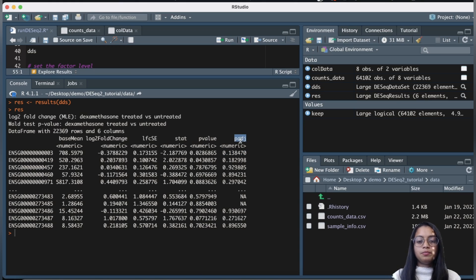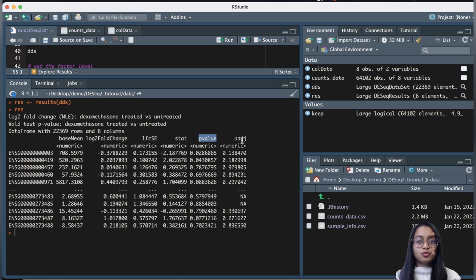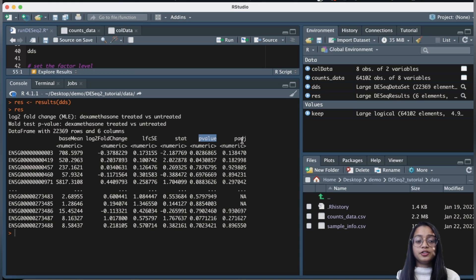We need to correct p-values for multiple testing because when performing many statistical tests at a p-value threshold of 0.05, five percent of genes called significant are false positives due to random chance. In our dataset with around 22,000 genes, that's about 1,100 false positive genes — a very large number. DESeq2 employs p-value adjustment methods to account for this problem and avoid detection of false positive genes.